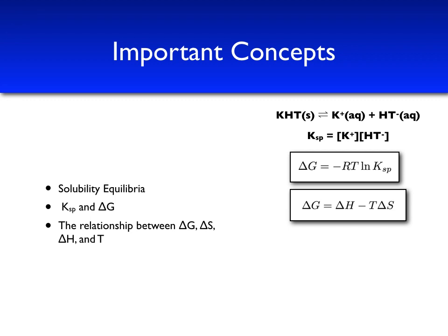In this experiment, since we are determining delta G at different temperatures, we can plot delta G as a function of the Kelvin temperature. Our data can be fit to a linear function that has a slope of negative delta S and a y-intercept of delta H. Therefore, in this experiment, we'll be able to determine not only the KSPs at different temperatures, but several thermodynamic properties.